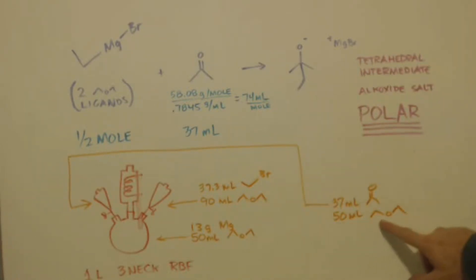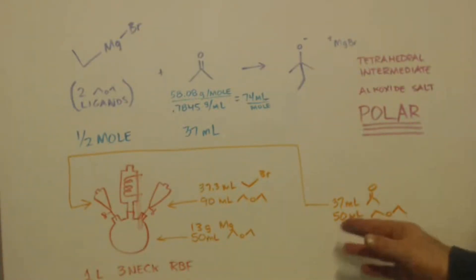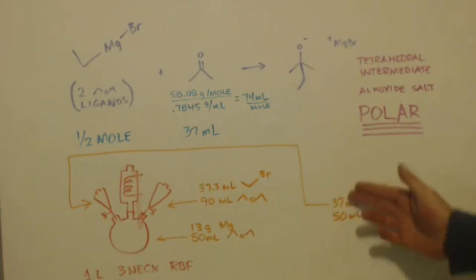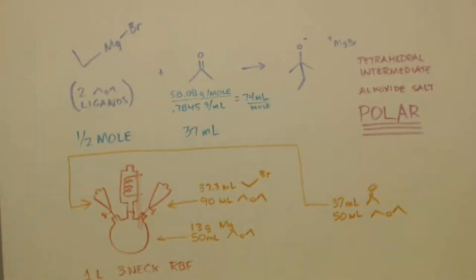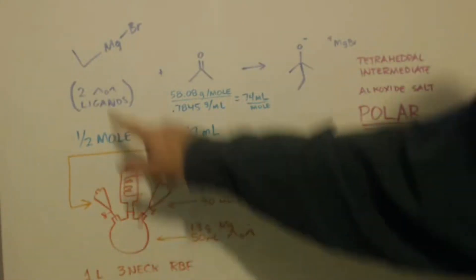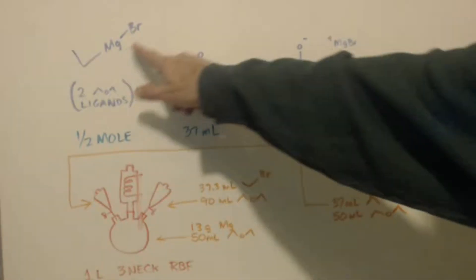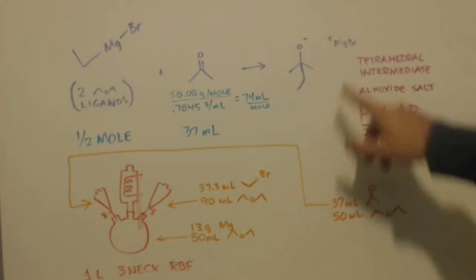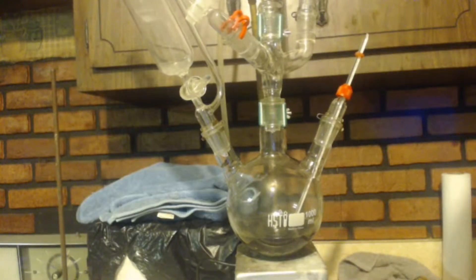I was going to put in 37 milliliters of acetone, but I have OCD so 50 is a good number for me. I'll put 50 milliliters of diethyl ether in the separatory funnel — slightly more than a 1-to-1 ratio — and drip that into the ethyl magnesium bromide Grignard reagent to conduct the actual Grignard reaction. You can also see the metal is pretty much all gone.